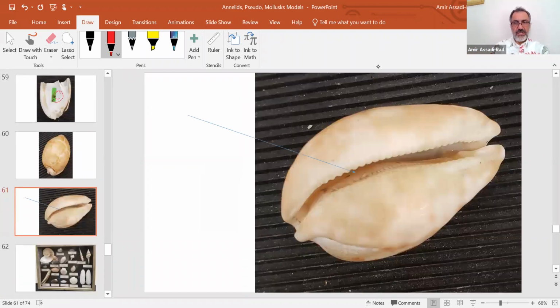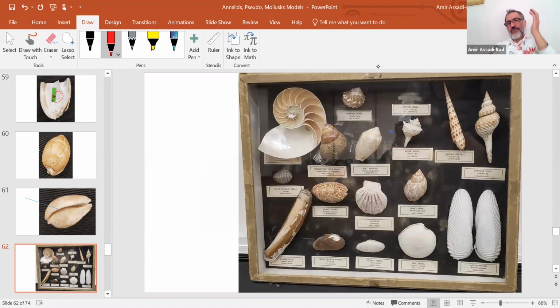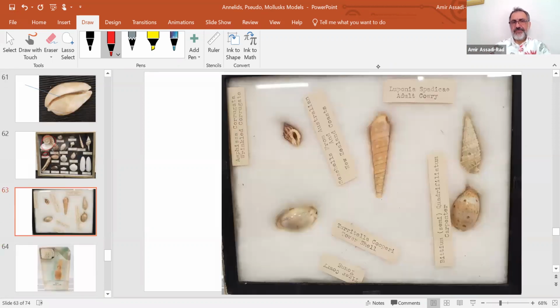Gastropoda, aperture, it's a gastropoda. And then here's a variety of different types of shells that you can enjoy and look at. Make sure you do not worry about the common name unless the ones that I mentioned, like the mail shell, chiton, nautilus, of course. The rest, I'm not too crazy about it. Bivalve, you know, oyster drill and things like that. Yeah, you can study them. Everything here is a gastropoda.